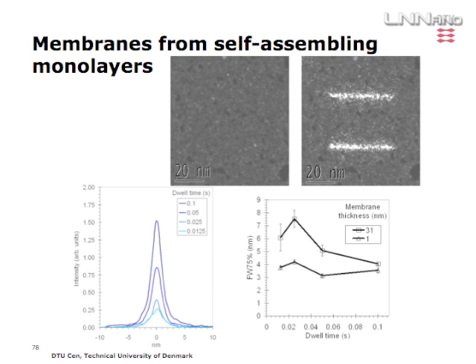This is written on a self-assembled monolayer, so a carbon substrate, where you can see you wrote two lines here. And the full width, the intensity, is a function of how long you park your beam. So this is the high angle annular dark field intensity as a function of how long you park your beam at a given position.